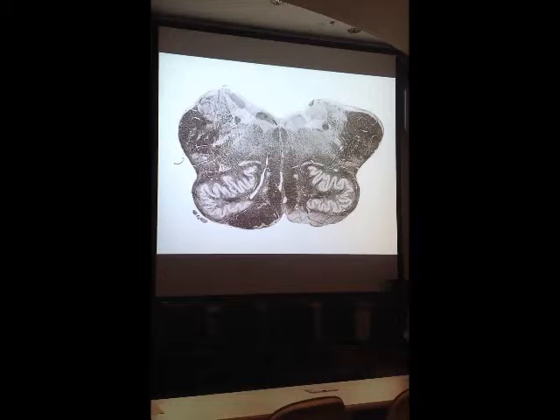Sorry, what's that big one in the top? Top where? Top right hand of the fourth ventricle. Oh, right here? Yeah. So this is part of the vestibular nuclear complex, mostly. And the dorsal motor nucleus of the vagus is right in here. Okay? Now, out here, I'm pretty sure that this is the lower part of the cochlear nuclei. I don't have the thing in front of me. I haven't talked about it for years, but I think that's part of the cochlear nuclei. But this should be mostly vestibular nuclear complex. In here, as I recall, we're starting to pick up some of the lateral cuneate nucleus. But that's not on your list. Okay? All right. Next slide then.